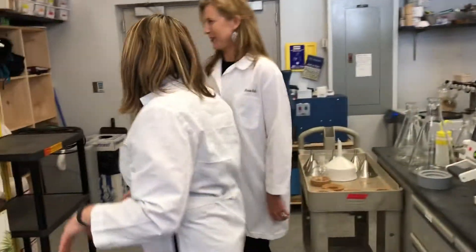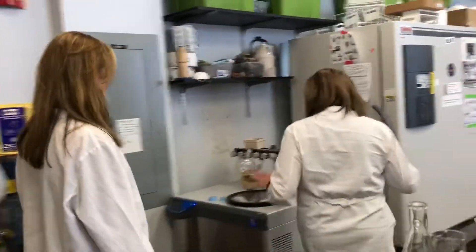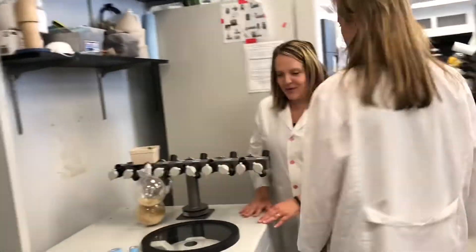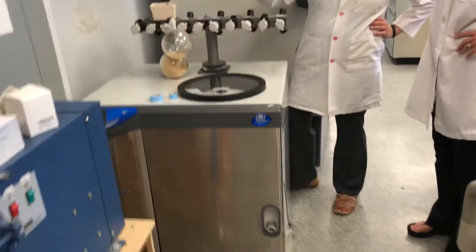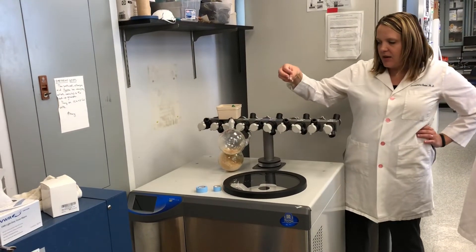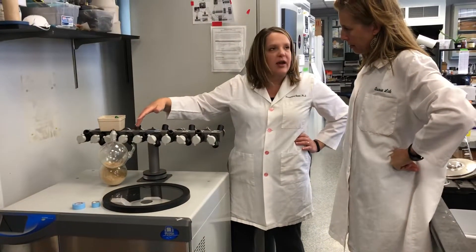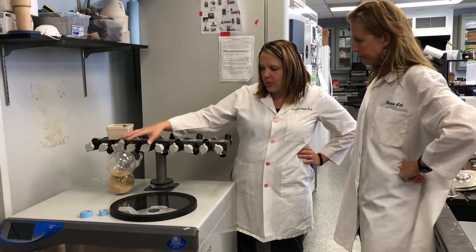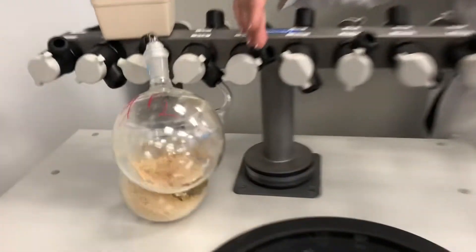Now I'm going to show you how we do our freeze drying. This is our freeze dryer. We start by freezing our flasks, and then basically you have a little bit of ice crystals that form with the extract. In this machine, it pulls all the water out, so in the end you're left with a nice fluffy powder.